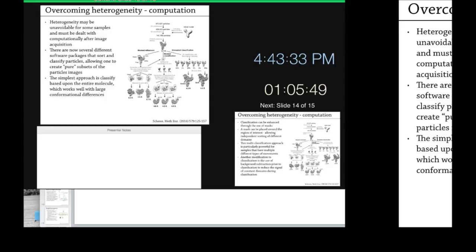It's a good question. I guess it varies greatly with each data set. Of course, the contrast has been a big thing. It's changed, and like you said, if there's any gold, if you're using a gold grid, it'll pick on that automatically. So I have had to go through each micrograph manually and just clean it up, but I don't unpick anything that may be a particle. I only unpick it if it's the edge of the grid or something like this. That takes forever. Yeah.